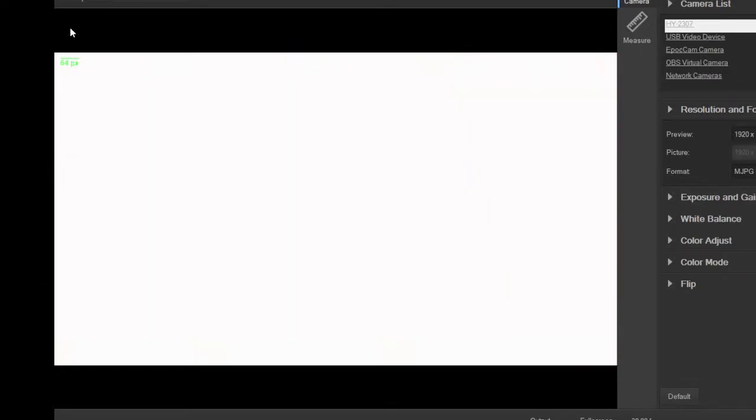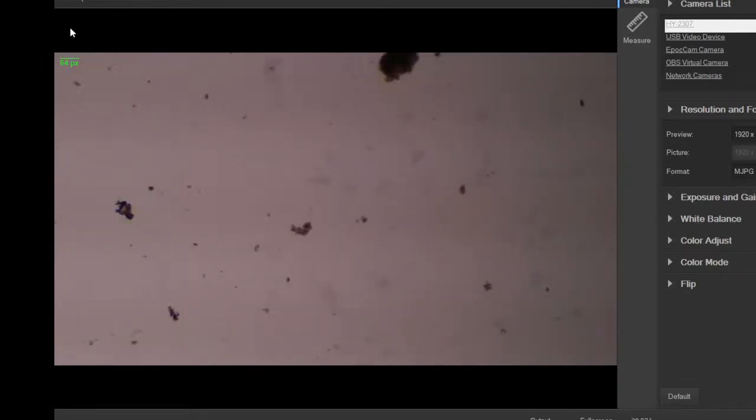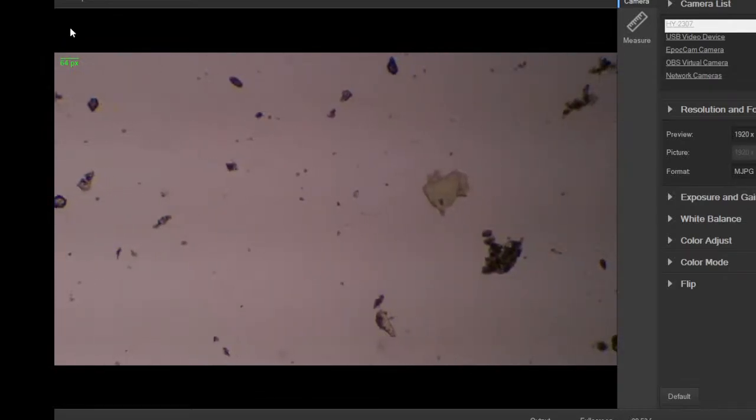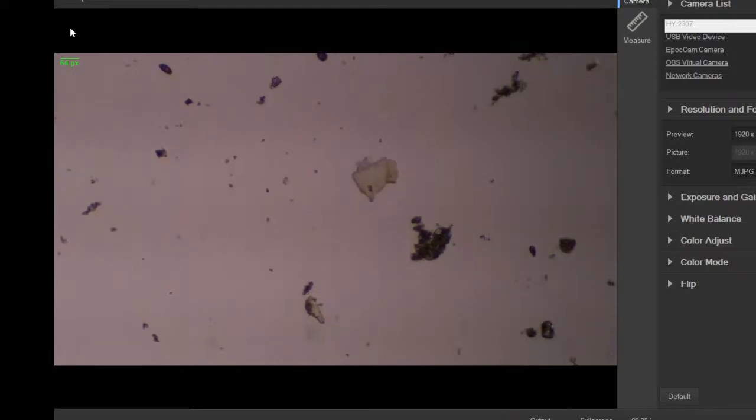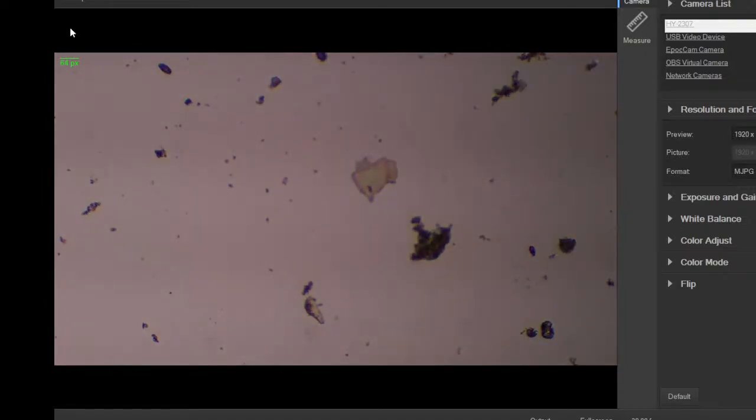Oh, that's cool. Alright, let's go out and look for another thing. So I still have another bottle I want to look at. What brightness on this? It's like the auto gain control is out of whack here.